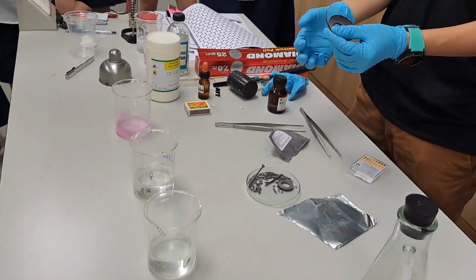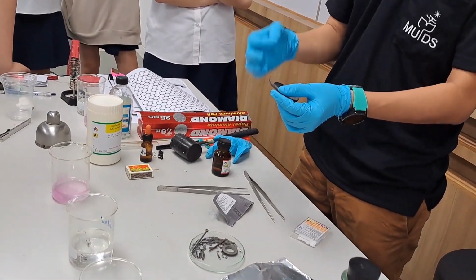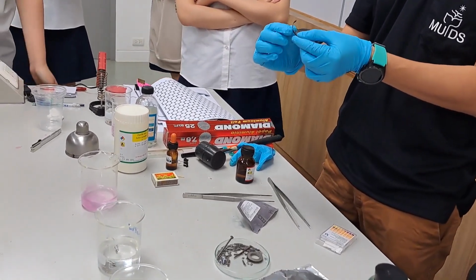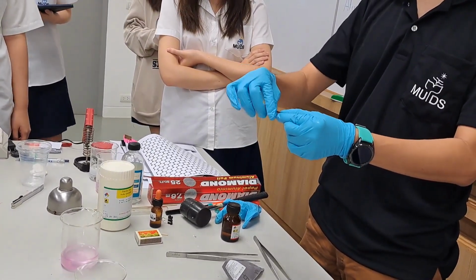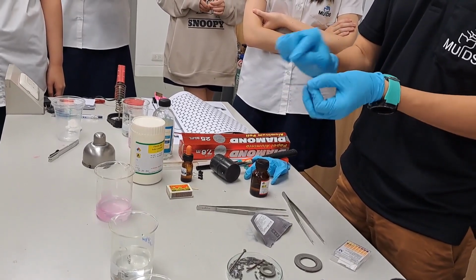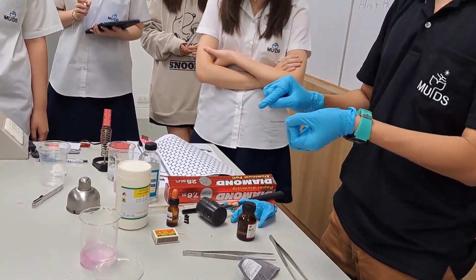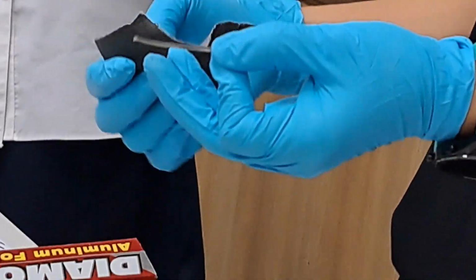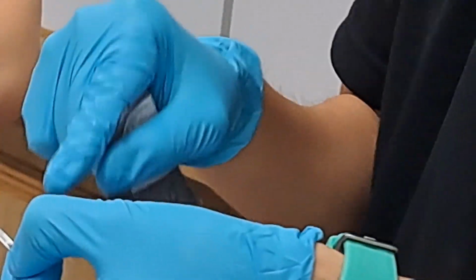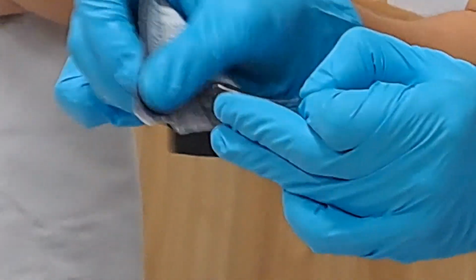And magnesium can be tough, but this one is soft because of the thickness. This is very thin, so you can bend it and actually snap it. So this black part is the coating. Okay, it can be magnesium oxide or other coatings. But when you sand it, I mean polish, and take the coating off, you see, it is shiny. This is the texture of the magnesium without the coating.